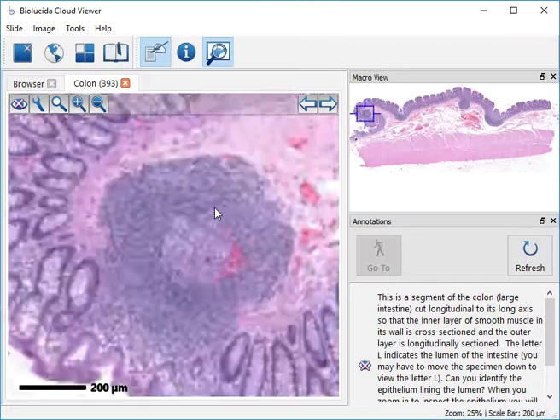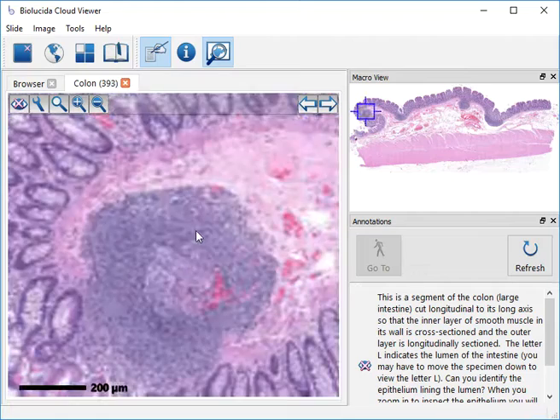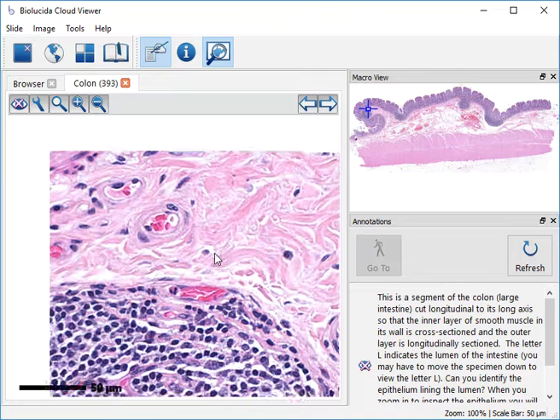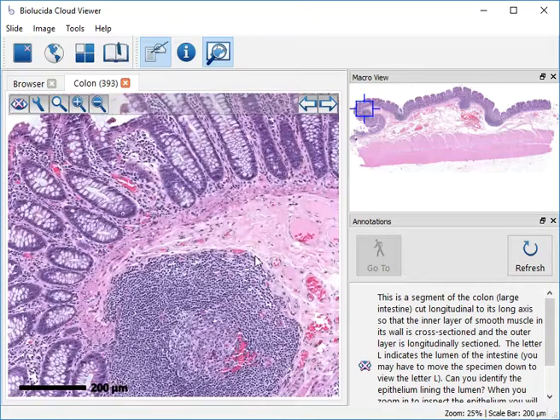And now this is a patch, actually a lymphatic nodule, where you've got more lymphocytes being produced, and these are lymphoblasts in here, and then they've migrated. Now you don't need to know all of this for the first module quiz, but you do need to be able to recognize lymphocytes as little tiny round nuclei that do not show much cytoplasm. And of course here, these are very tiny blood vessels lined with simple squamous epithelial cells.